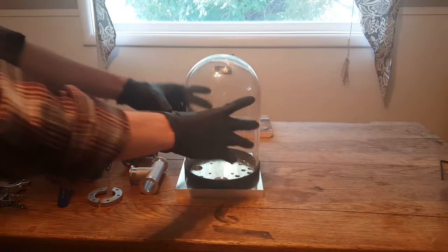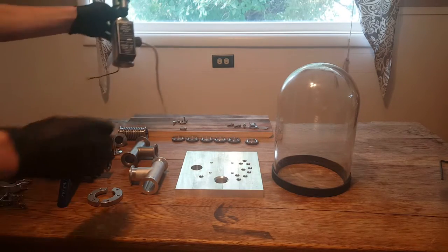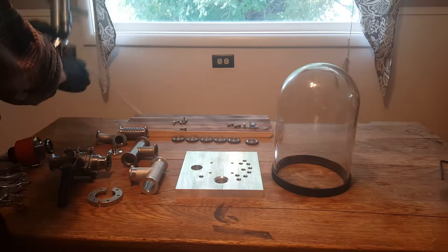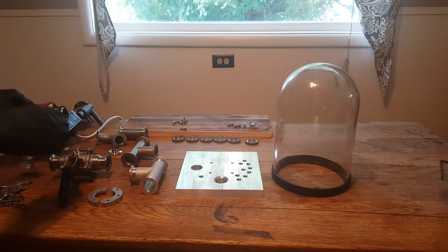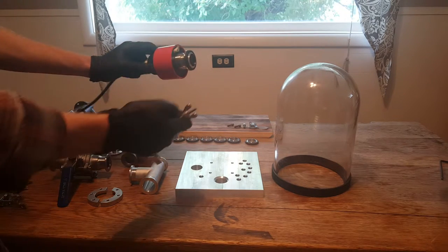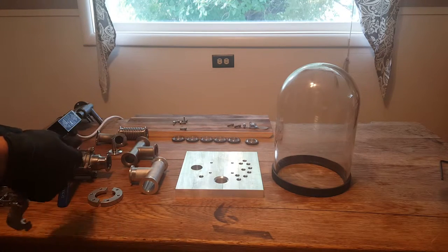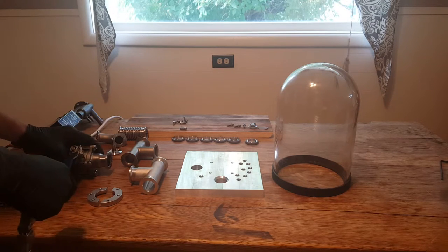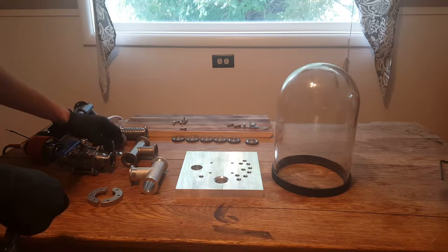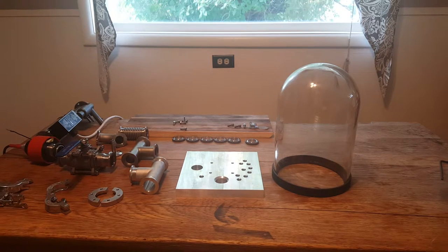Besides the bell jar, we also have some other components here. We have a vapor diffusion pump, which I'll be doing a video on shortly. We also have a very magnetic penning gauge here to measure high vacuum pressures, along with various valves, a baffle, and some connectors. So let's get right to it and assemble it.